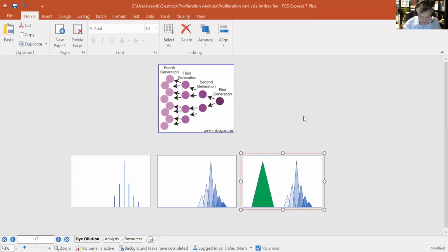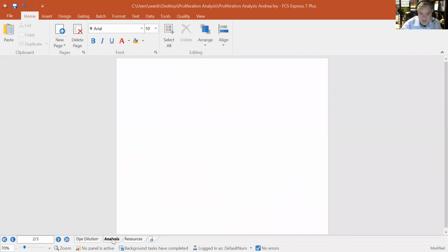So I do recommend, if you have folks that you can talk to at the core facility before you jump into this stuff, go speak with them, and maybe they can show you some of the common pitfalls that people run into before you waste a week and realize the data doesn't look so great. So let's jump right into this.